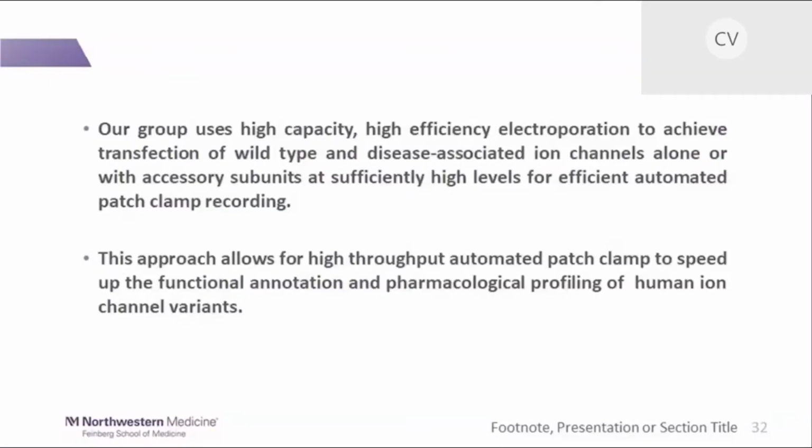Yes, I do. Our group in the Department of Pharmacology uses high-capacity, high-efficiency electroporation to achieve transfection of wild-type and disease-associated ion channels alone or with accessory subunits at sufficiently high levels for efficient automated patch clamp recording. This approach allows for high-throughput automated patch clamp to speed up the functional annotation and pharmacological profiling of ion channel variants.